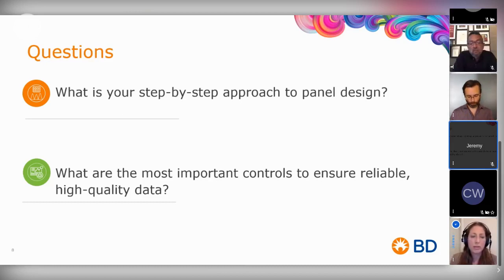And then there are multiple biological controls that you might want to think of. Are you using some buffers that might affect some of the stainings? Or if you're doing activation assays, have a sample that has not been activated, as well as one that has been activated, so that you know you can actually measure all your antigens.